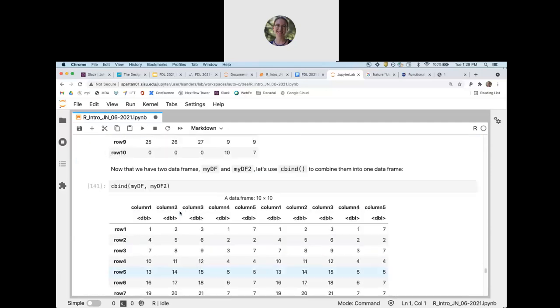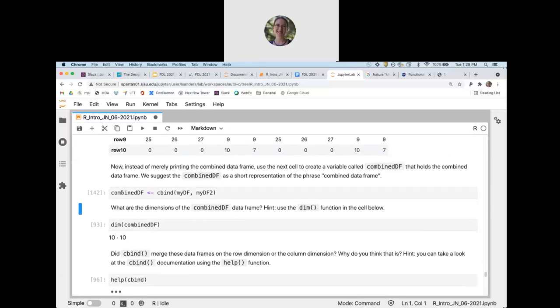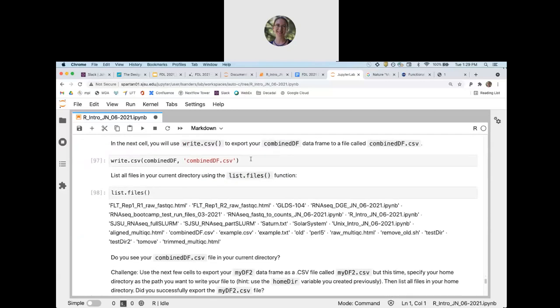Since the kernel restarted, it lost all of my variable names, so I just had to rerun all of these cells again. Okay, so I now have my variable names back. So where were we? All right.